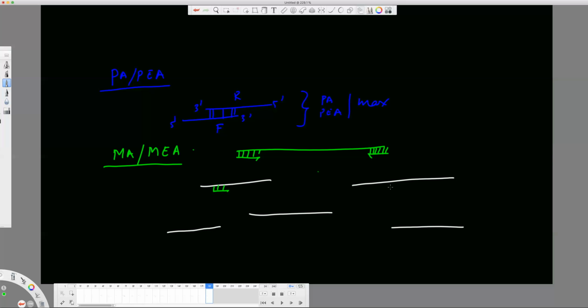Now, there can be a scenario which looks like this. This is your 3' end, and there is a very good complementarity at the 3' end of the primer. Now the 5' end is opened up because there is no complementarity here, so it's not hybridizing to the non-specific DNA. This was your specific DNA target. This is non-specific. However, the 3' end is annealing there, and now again your polymerase will come, recognize this end, and this is your template, and start amplifying this. The wrong product, isn't it?